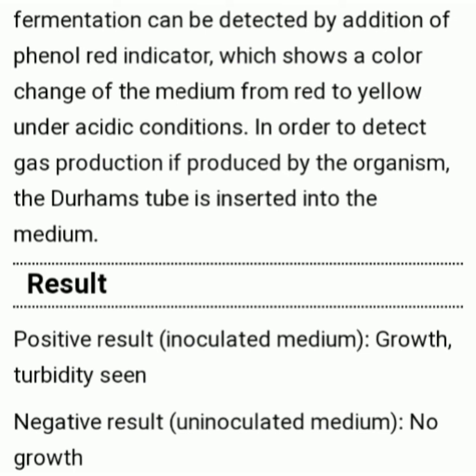Whenever any bacteria grow in the medium, they increase the acidity of the medium. Then how can we know that this microorganism increased the acidity of the medium? We use the other indicator, phenol red, which turns from red to yellow when the acidity increases, right?